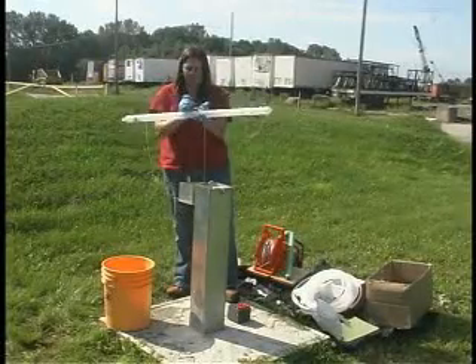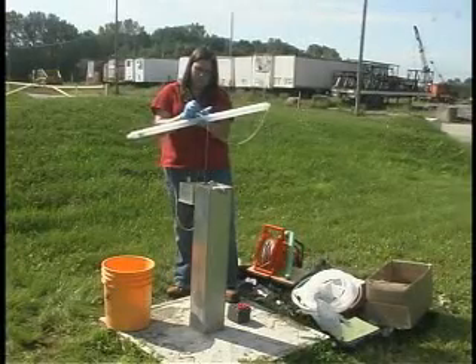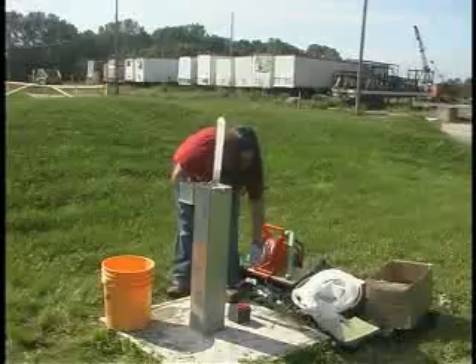One of the positives with baler sampling is the fact that the entire system is disposable. One can dispose of the string, the rope, and the baler.